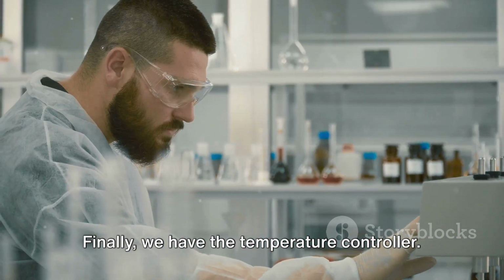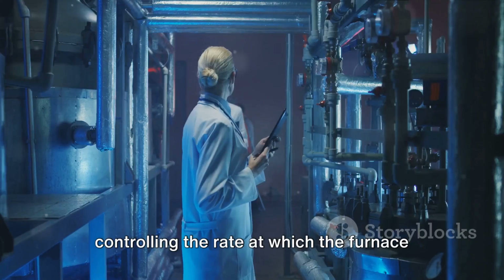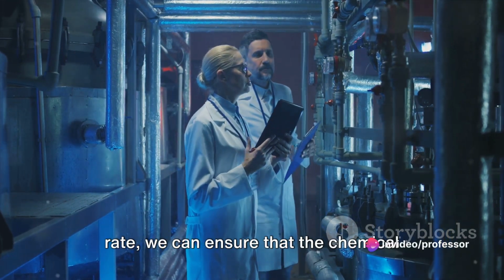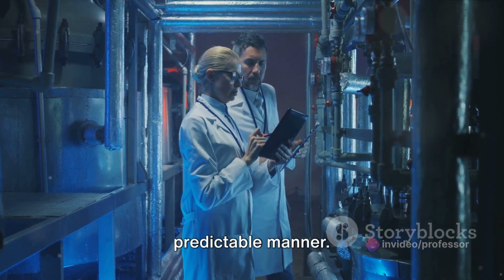Finally, we have the temperature controller. The temperature controller is tasked with controlling the rate at which the furnace heats the sample. By carefully controlling the heating rate, we can ensure that the chemical reactions occur in a controlled and predictable manner.